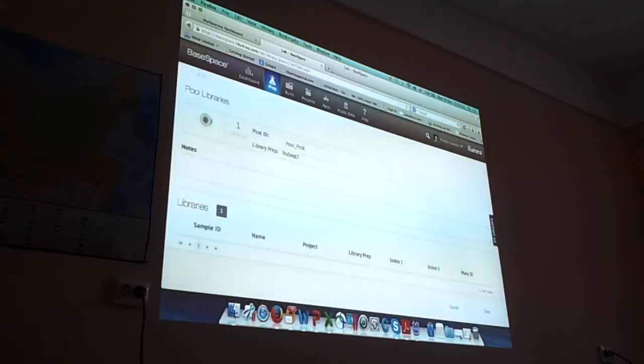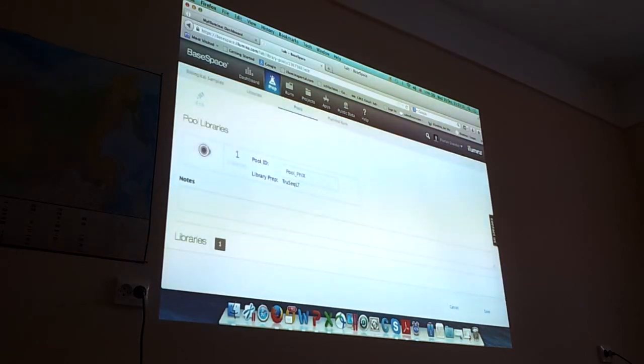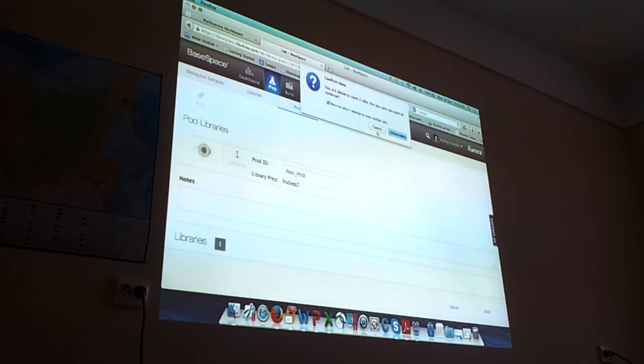I suspect that I cannot share it before it has actually run. Okay. I see. Then we have to do the same with your account, or we just run it with your account later. Maybe Julia can do it. Yeah, so she can. Okay.